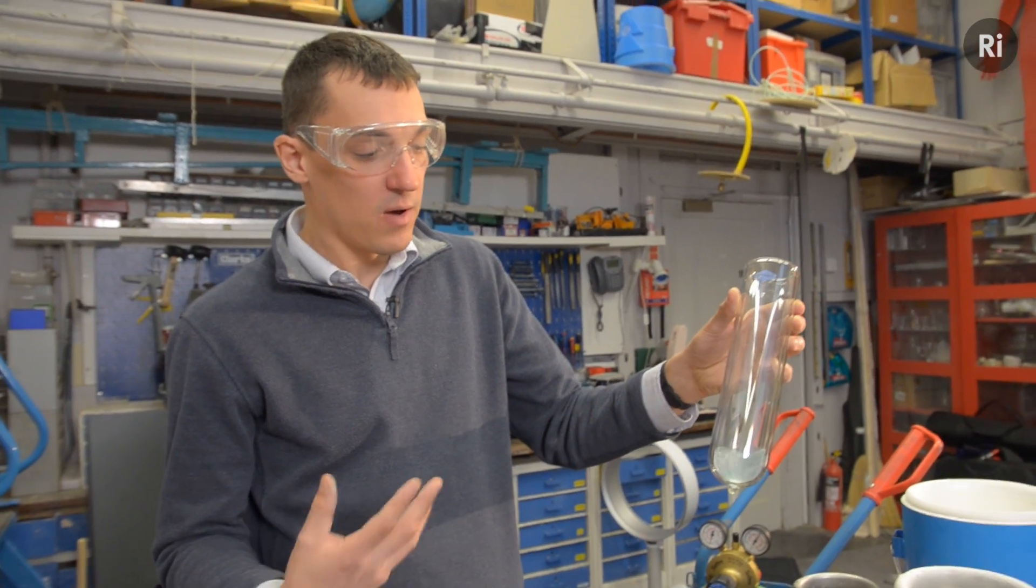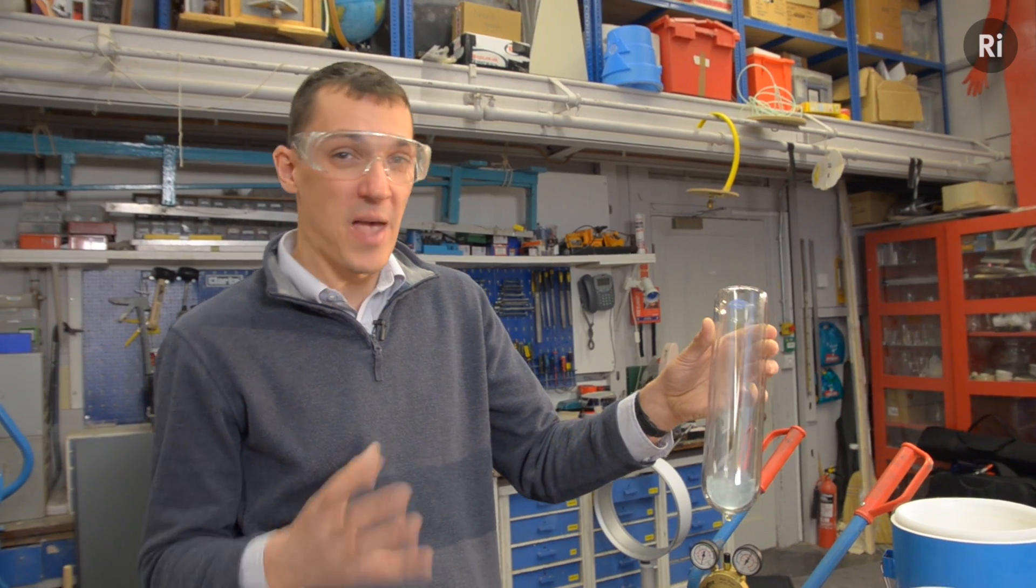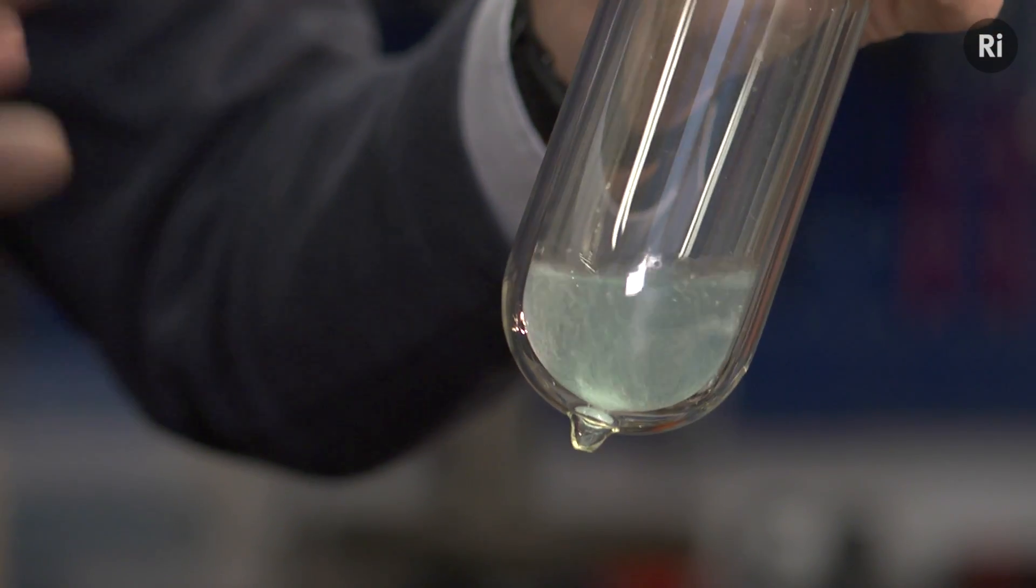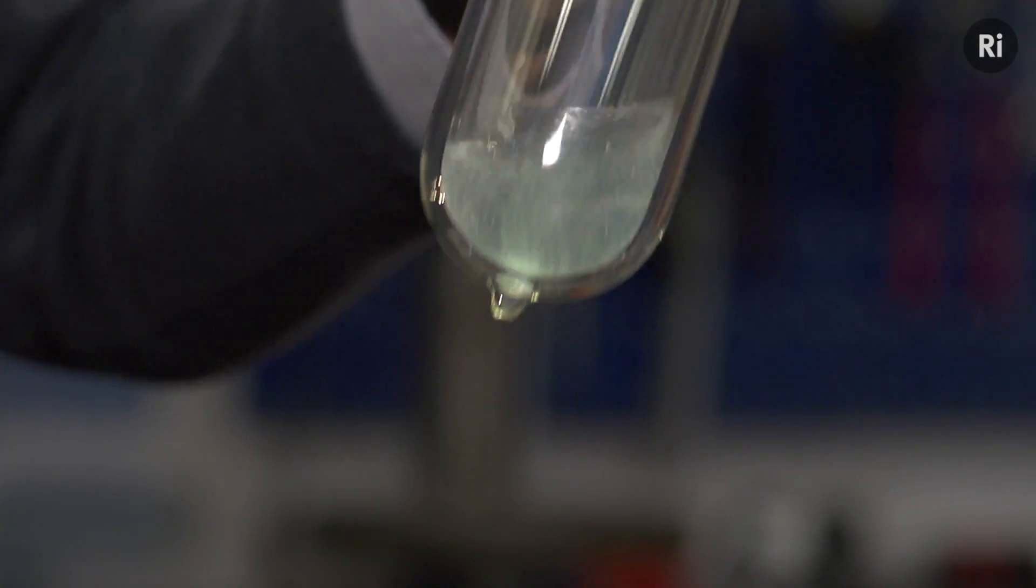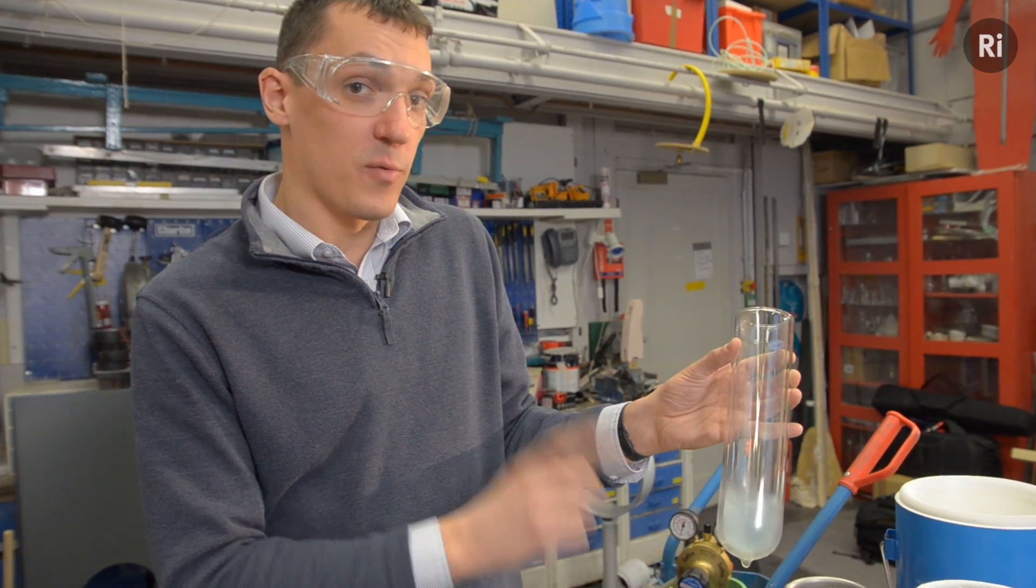What that is actually is that there are unpaired electrons. Electrons usually like to pair up, but in oxygen there are a couple that doesn't happen to, and we call them unpaired electrons. And there's actually another unusual property of oxygen that arises from the unpaired electrons, which I want to show you now.